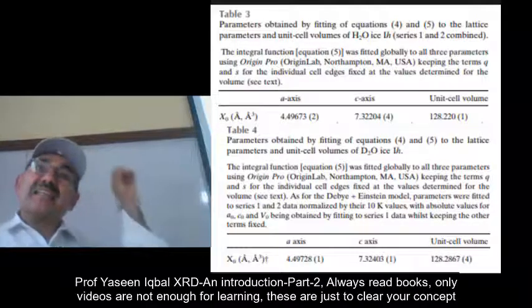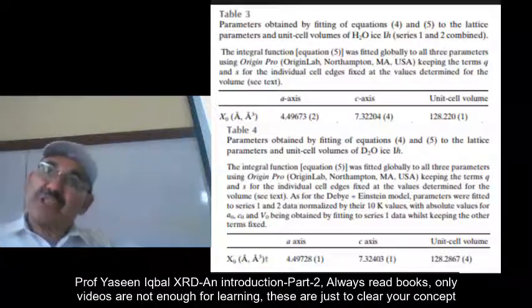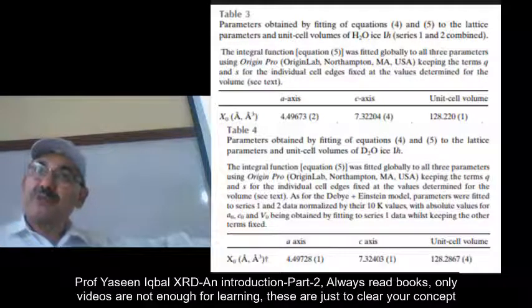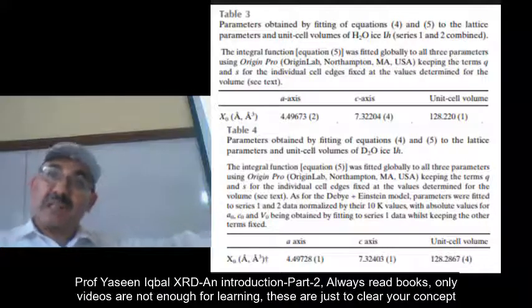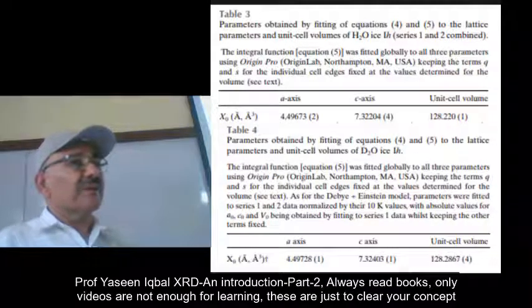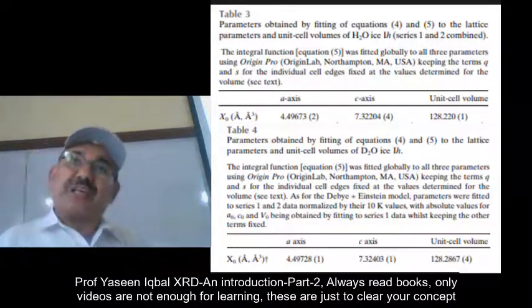That is, is it matching D2O or H2O? There may be other compounds like that. So check all the relevant compounds. But common sense should also not go away, right? Common sense should also be used every time.